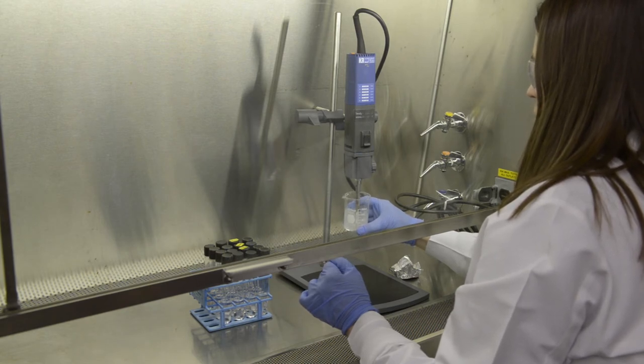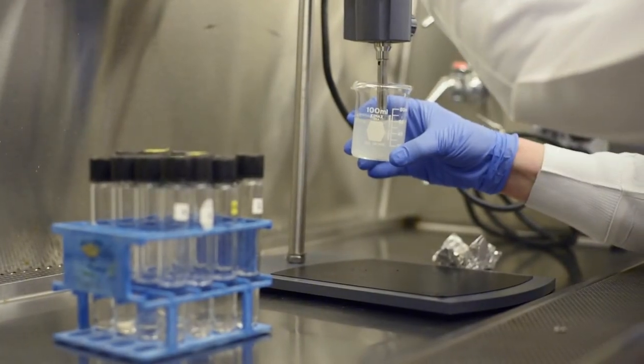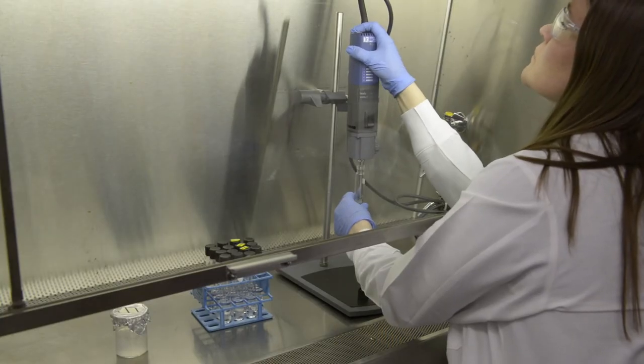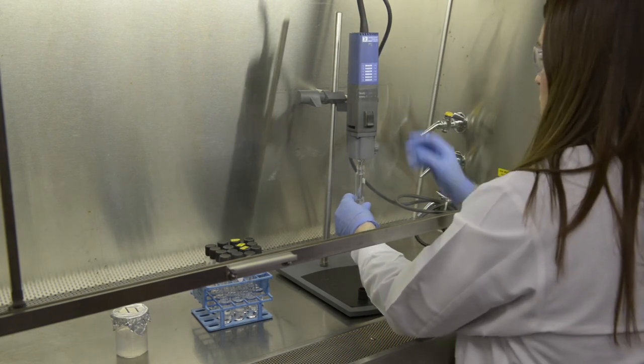If more than one sample will be processed, use a new disposable probe or clean the probe between samples as follows. Homogenize a 9 milliliter sterile dilution blank for 30 seconds.